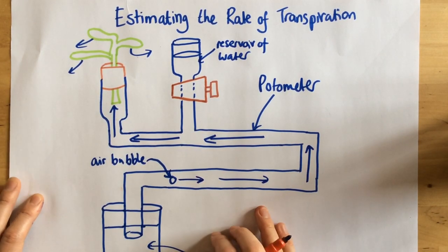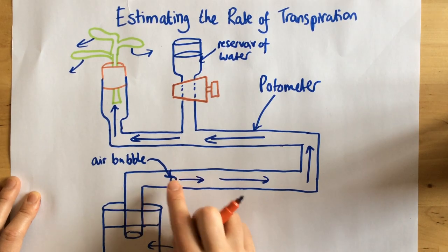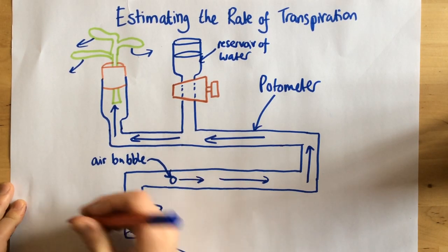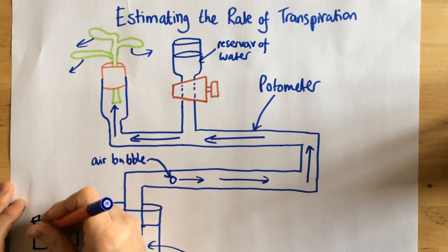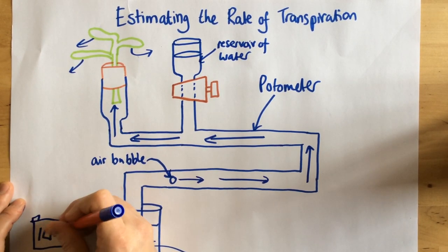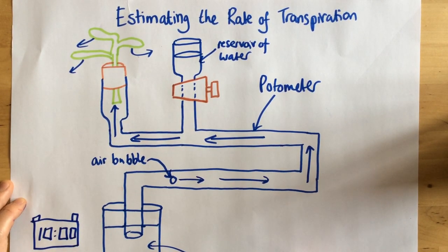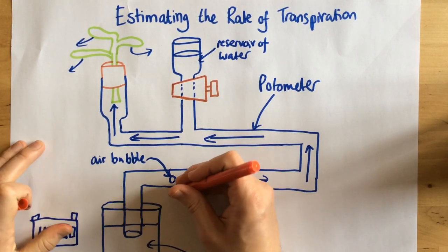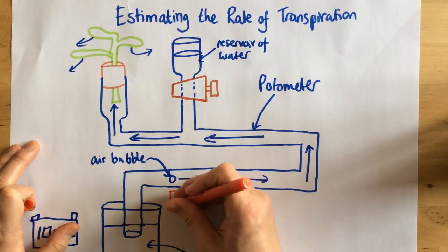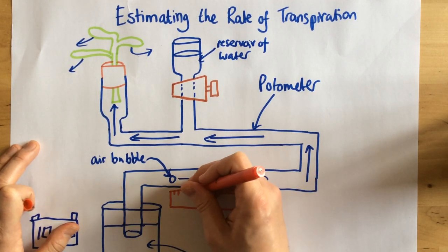Now, how we estimate the rate of transpiration is we need to see how this air bubble moves over time. So let's say we're going to time our experiment and we're going to leave it for 10 minutes on my stop clock down there. Okay, now what I need to do is I need to get a ruler. So here's my ruler right here.